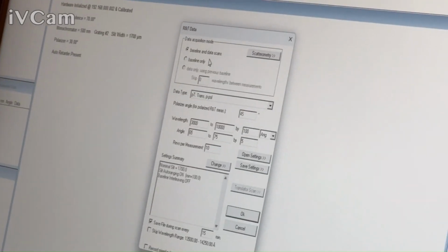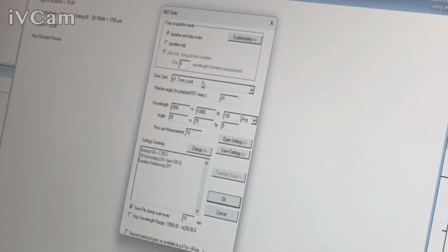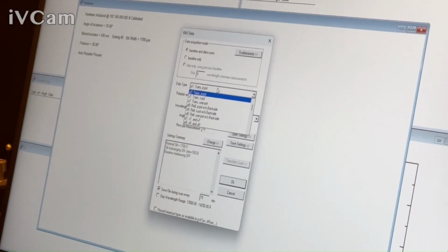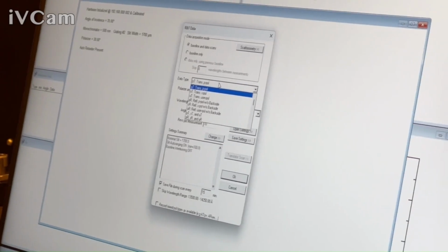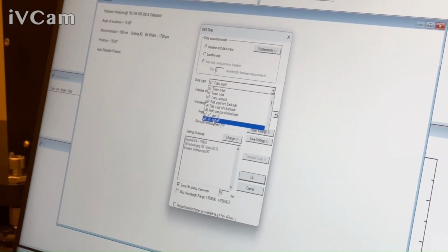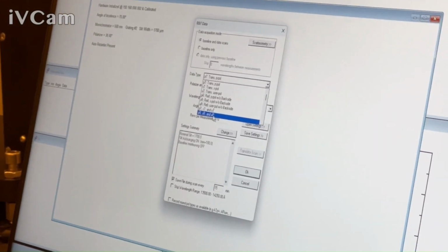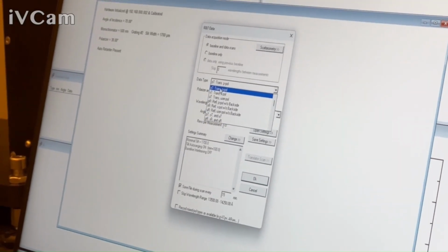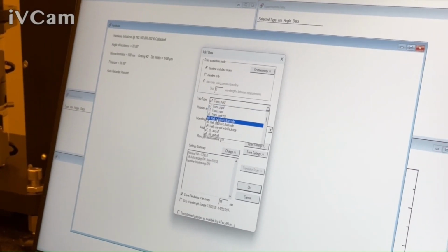Since we're doing it on the sample here, we'll try to do, again, we could do all types, which would be P polarized, S polarized, and U, which is by default the polarizer set to 45 degrees. But for now, you're mainly looking for P, just to go quicker. We're going to probably try to just do P.